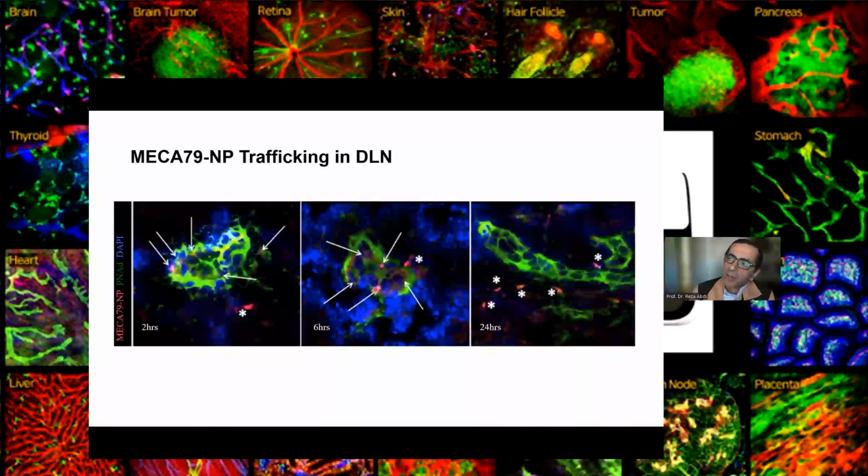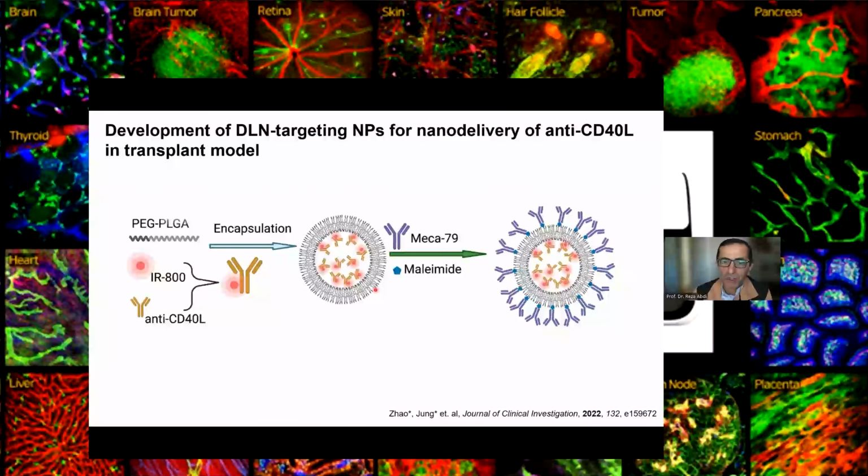And the other question I had, maybe Pilhan, you can explain after or during Q&A, is how we can see antibody-drug conjugates, how we can see small molecules that are very small. And can we also put in an imaging technique? For instance, you put in a chemotherapy drug. Can we show in a live image that cells are dying? Those are interesting things to do, especially if you have a marker for apoptosis, right? Those are things I was going to ask you. So if you have time toward the end, we can.